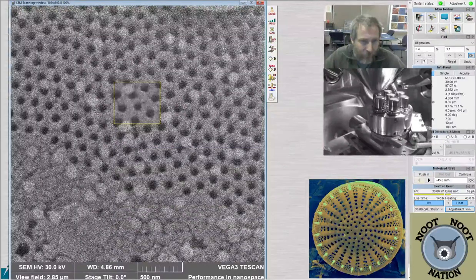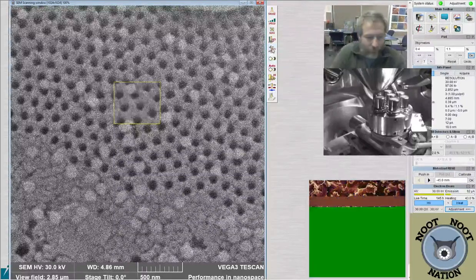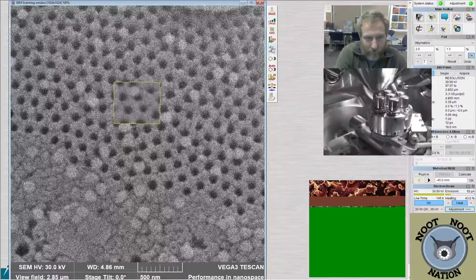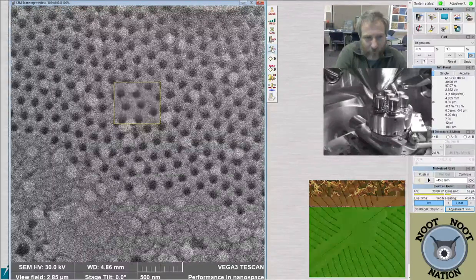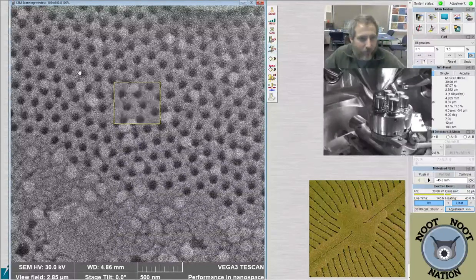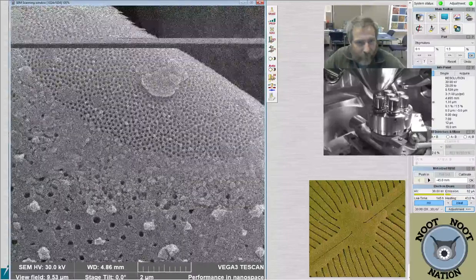And when I have a whole bunch of little holes like this, I usually like to try to improve my image quality just a little bit by playing with the settings to get the stigmation as perfect as possible. There's always an opportunity to improve my focus quality just a little bit, but this is one of those. So I think that looks good.